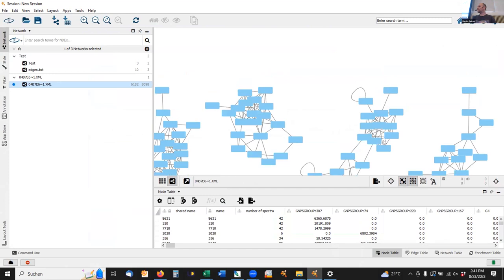So who of you has a molecular network in front of them? Right. Okay. Who is still struggling? Okay, then if it's just a few, some of the other instructors could pass by and give you a hand with that. Just raise your hand, please, once again.